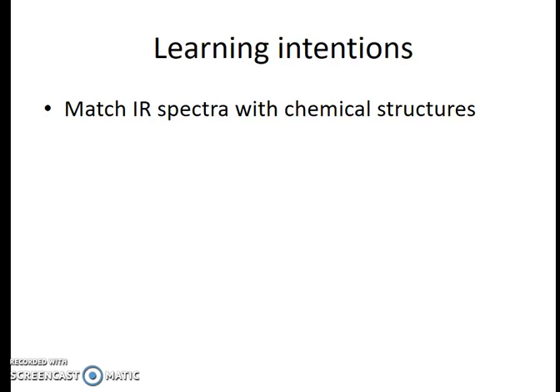Hello everyone, and welcome to our second video looking at IR spectra, where today we're going to be looking at matching up the IR spectra with some chemical structures. So this is really thinking about what the spectra is showing us and how that fits with the possible compound structures that we might have.